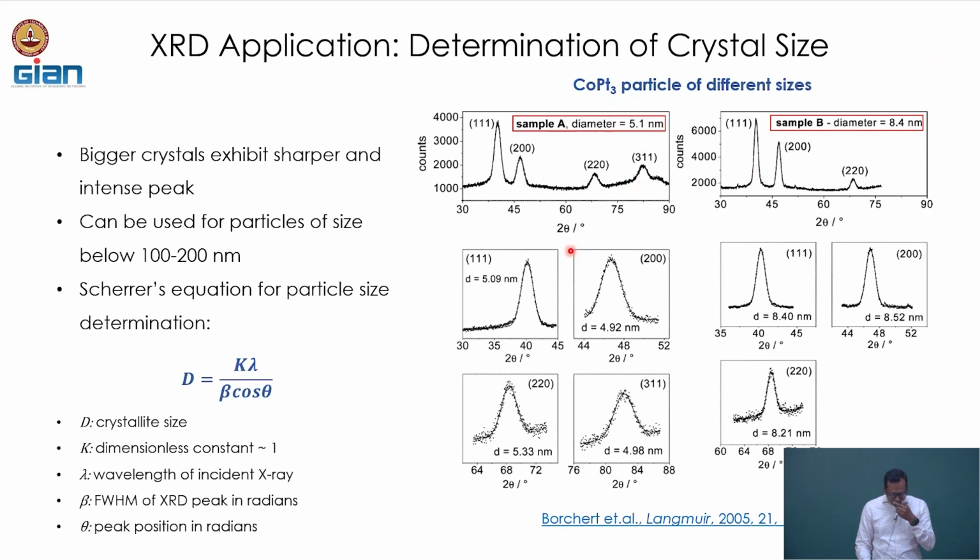Okay, so what we are seeing is that if there is uniformity in the crystallinity, which was lost a little bit in the other experiments, then for the bigger particle we have higher intensity, as well as the peaks becoming sharper and sharper, which someone participating online just said, that the full width at half maximum is going to change.